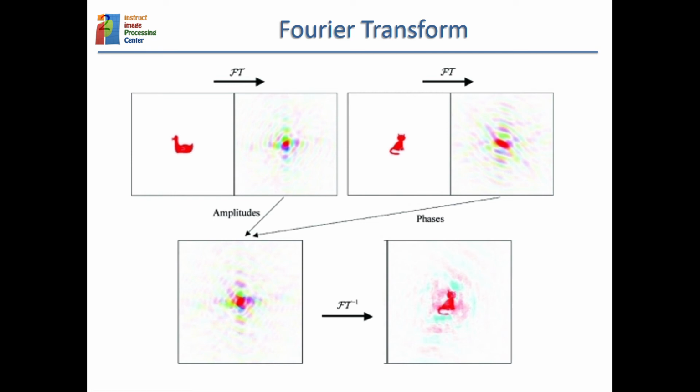And in cryo-EM we are recording amplitudes and phases at the same time, while for instance in crystallography they can only record the amplitudes, and then the phases have to be inferred computationally. So that is one of the main advantages of cryo-EM. The disadvantage is that this amplitude and phase information is embedded in a lot of noise.